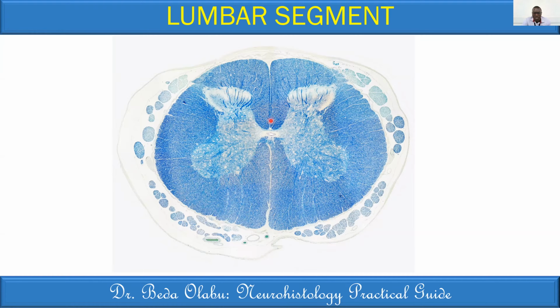We can't, with a lot of confidence, say whether there is a lateral horn. I quite can't see any. And so again, it means that it is unlikely to be giving rise to an autonomic outflow. However, there's not much satisfaction in comparing the dorsal horn and the ventral horn in terms of the sizes. We can see that the ventral horn is big compared to the dorsal horn, but not so massively to scream about, but at least we can see it's big.